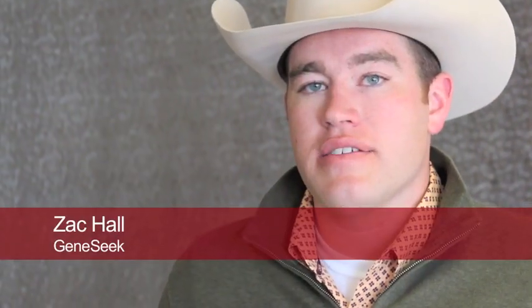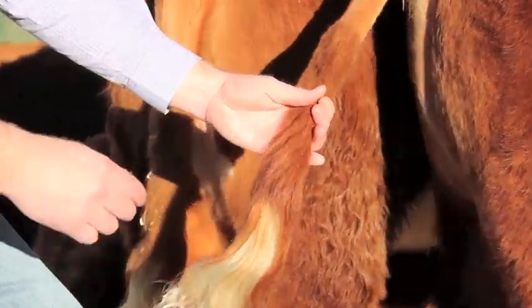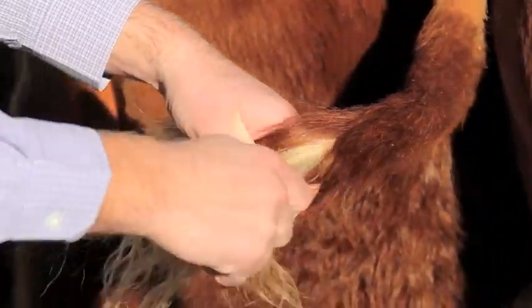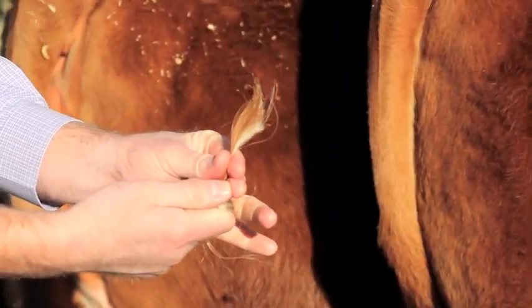In order to collect a hair sample properly, we want to take the sample from the switch of the tail, not the tail head. What you want to do is part the hairs near the base of the tail, wrap your fingers around the hair, and pull it up, back, and towards the animal.